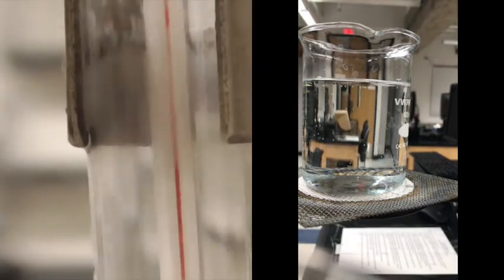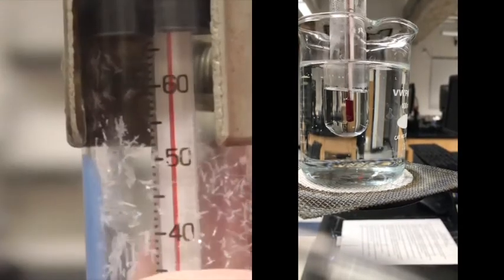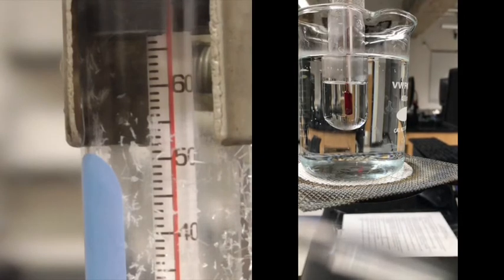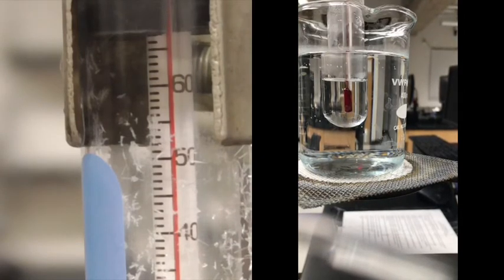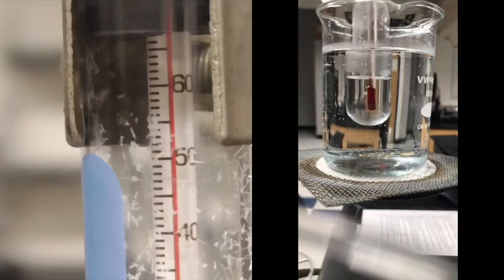And I'm going to put it in the clamp here. And remember, once it hits 65 degrees, we're going to start taking readings. And then we're going to take a reading every 30 seconds for 30 minutes. And we're going to note how it looks.